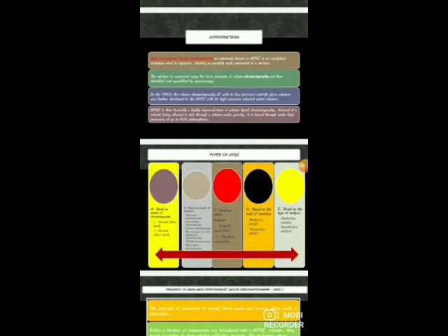Generally we know that in normal phase mode, the stationary phase is polar, that is silica gel, and the mobile phase is non-polar. Now in reverse phase mode, it is inverted relative to the normal phase mode, meaning the stationary phase is non-polar in reverse phase and the mobile phase is polar. It's vice versa between normal phase and reverse phase.